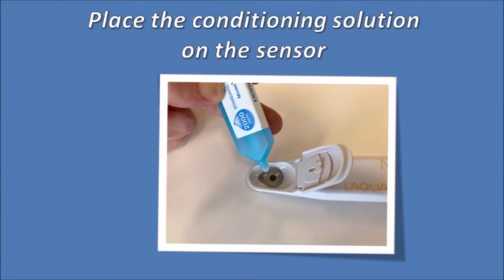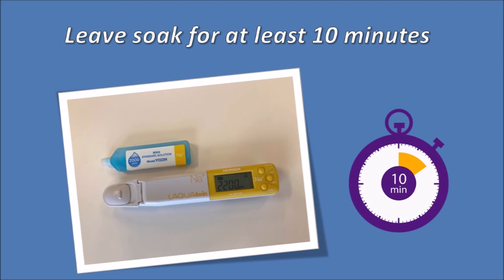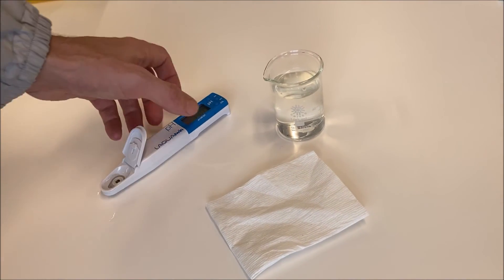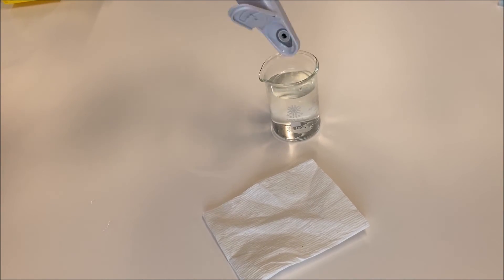To perform the electrode conditioning, pour enough liquid to cover the whole sensor area. Make sure that both parts of the electrode are soaked with the solution. Leave this solution on the sensor for at least 10 minutes and up to 2 hours. Then rinse and dry the sensor. The meter will be ready to use and will provide the best accuracy.